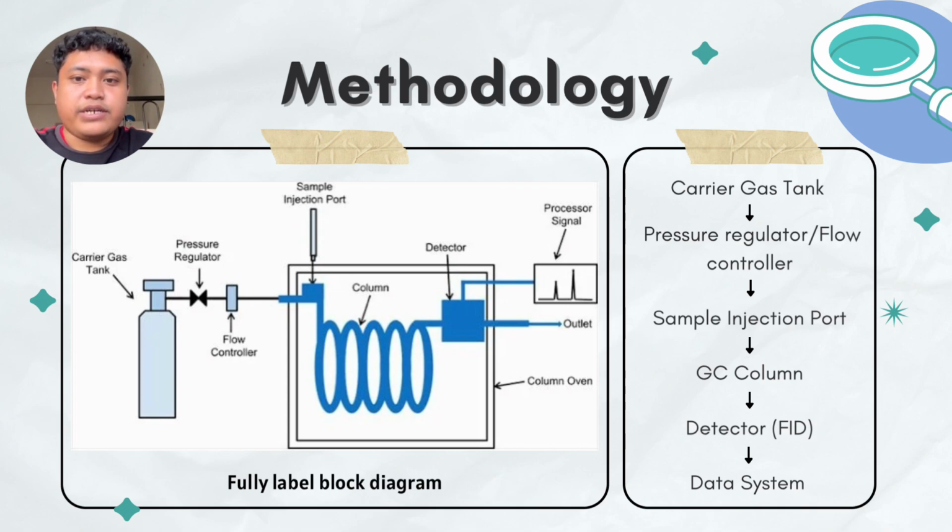My name is Zarul Mukris bin Ahmad, and in this slide, I'm going to explain the methodology that we use to achieve all the results and also to achieve all the objectives for this experiment. Here, we can see a fully labeled block diagram of the gas chromatography instrument. Next, I'm going to explain step by step how the gas chromatography instrument works.